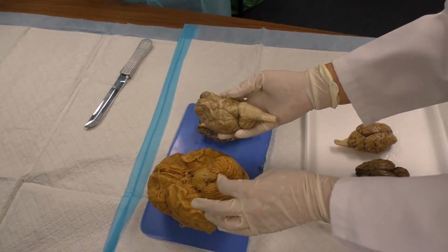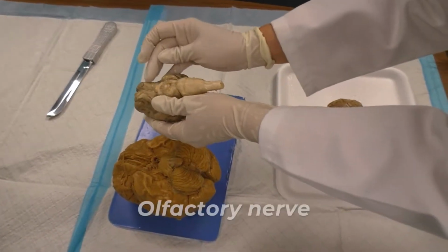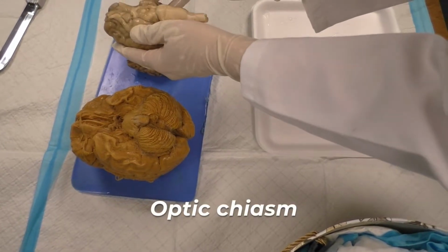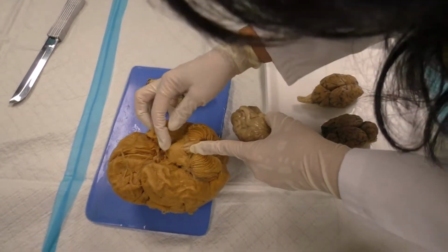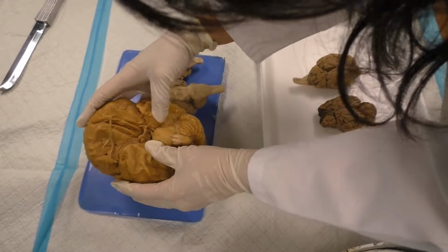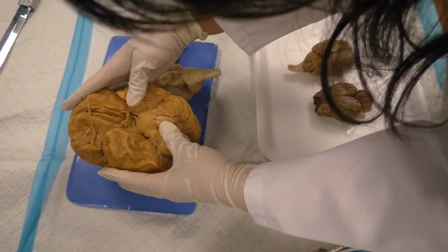And 1, 2, 3 are always easy to see, and then it gets a little bit harder. So 1 is olfactory. This is kind of worn out here. 2 is the optic chiasm. And 3 is this flap right there. That's a nerve. And let's see if we can find it here. This might have been kind of torn off.